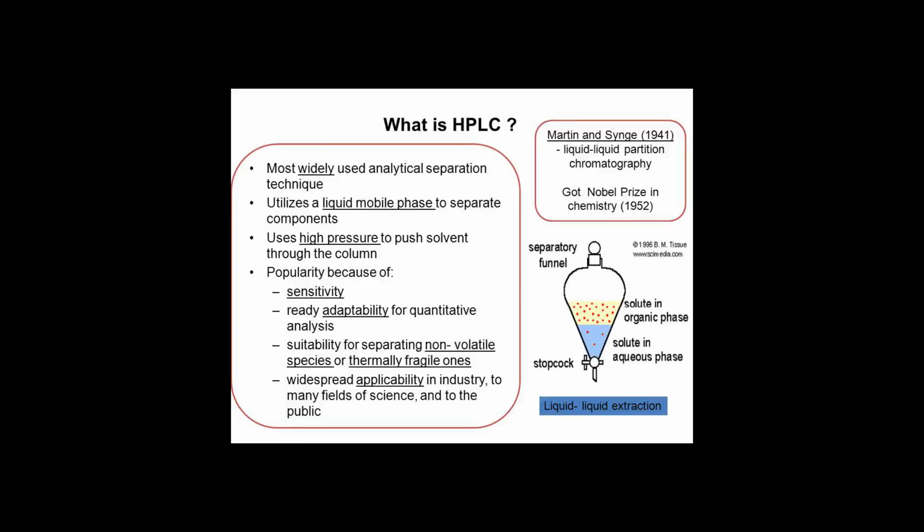Efficiency factor, N, practically measures how sharp component peaks on the chromatogram are, as a ratio of the component peak's retention time relative to the width of the peaks at their widest point at the baseline. Peaks that are tall, sharp, and relatively narrow indicate that the separation method efficiently removed a component from a mixture: high efficiency. Efficiency is very dependent upon the HPLC column and the HPLC method used. Efficiency factor is synonymous with plate number and the number of theoretical plates.